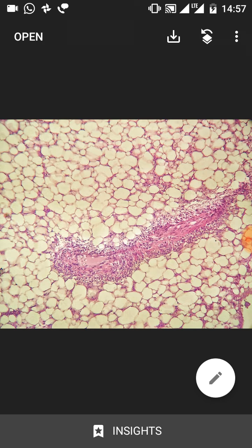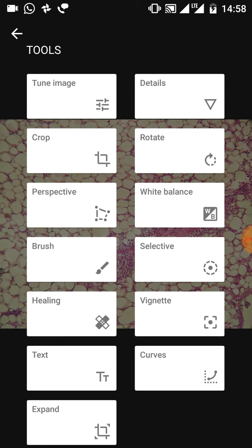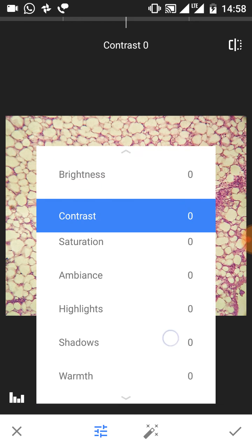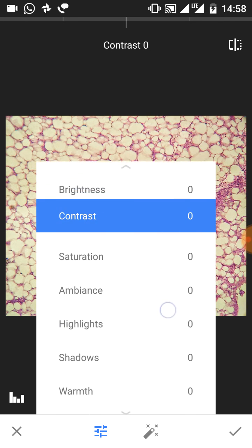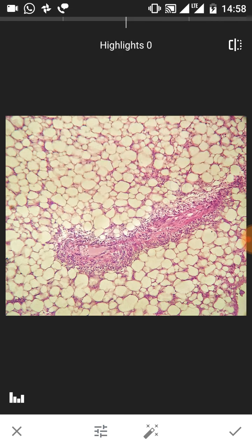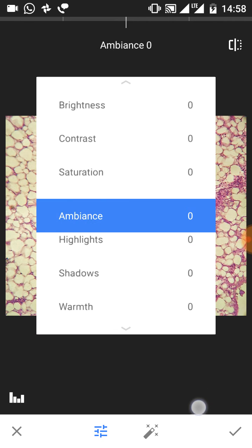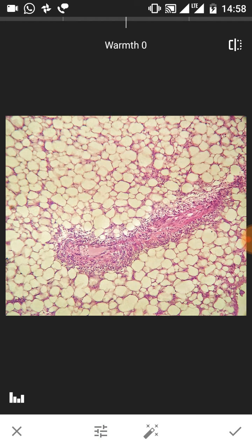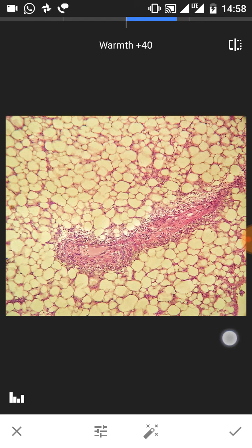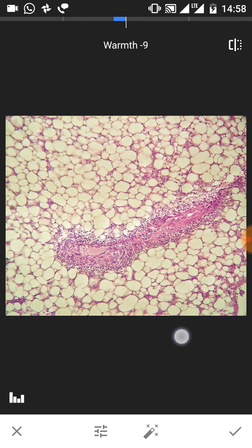If you want to change the color, warmth, or white balance of these photographs, go to the editing icon at the bottom right and click on tune image. When you move your fingers up and down on the screen you get options: brightness, contrast, saturation, ambience, highlights, shadows, and warmth. This photograph has a sort of yellow hue to it. Select warmth and move your fingers left or right — you can see a change in color. As you increase warmth it becomes more yellowish, and as you decrease it becomes more whitish. We decrease the warmth a little bit — that looks good enough.